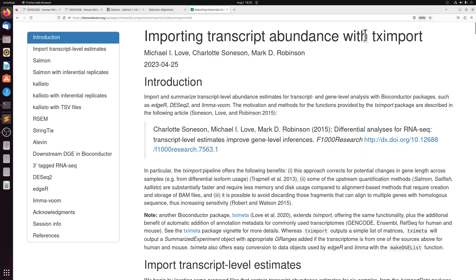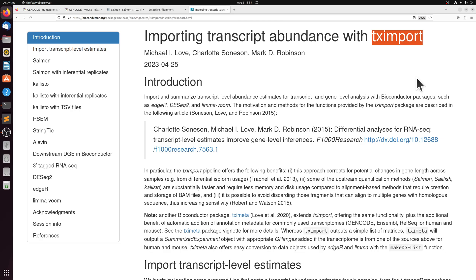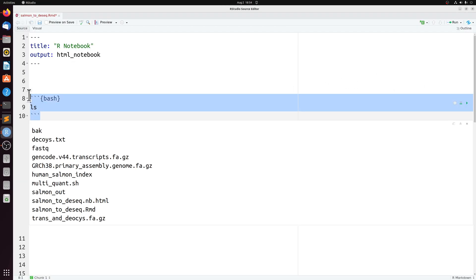So next we're going to use tximport in R to load in all those quant files. And importantly, we're going to use tximport to sum all the transcripts into individual genes so that we have gene level counts. Of course, with salmon, you can do transcript specific analysis, but we're just going to use this in this instance to do gene level analysis.